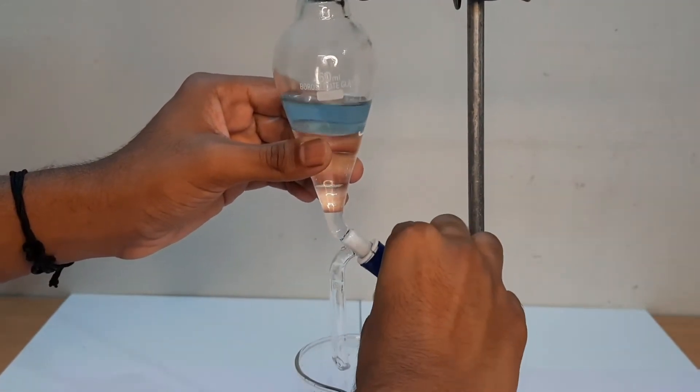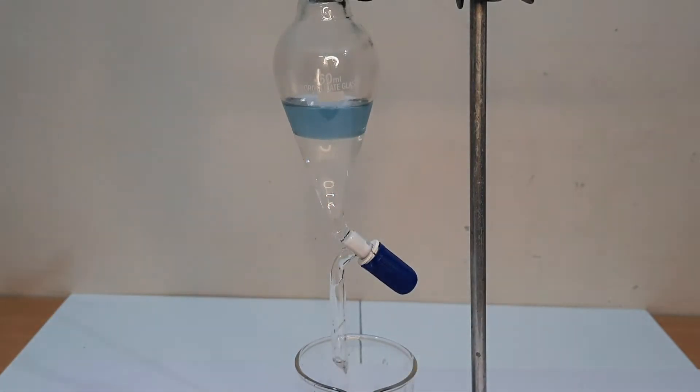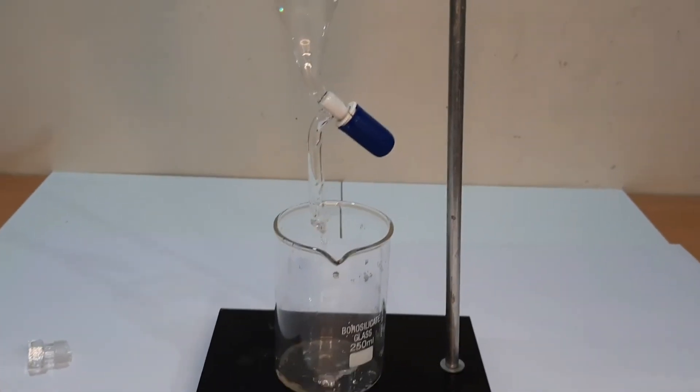On opening the stopcock of the separating funnel, the lower layer of water comes out first and is collected in the beaker.